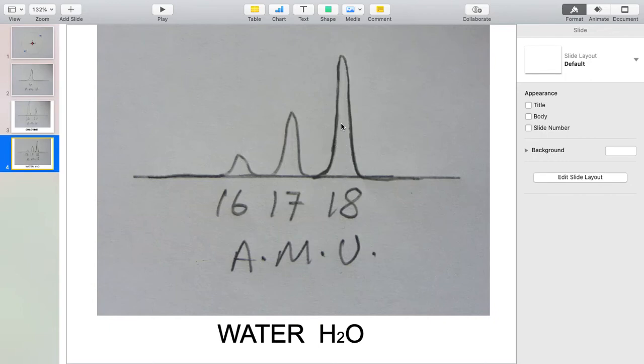With something else that had the same molecular weight as water of 18, it's likely that it would break up in a different way and give a different fingerprint. But another way that a mass spectrometer can look at this, now the sort of mass spectrometer that I've built, a quadrupole mass spectrometer, isn't working quite right at the moment. At the moment the resolution isn't quite as good as this. You will see when you see it working difficulty in distinguishing these peaks of water and oxygen.